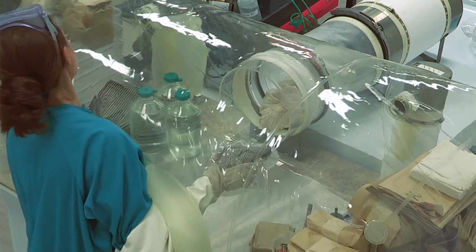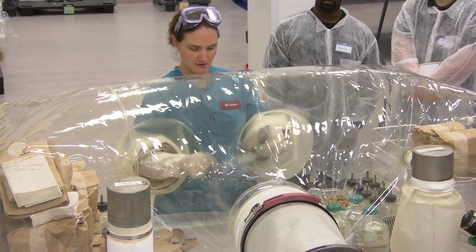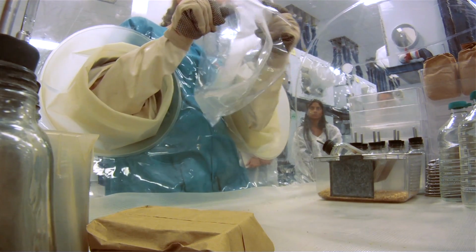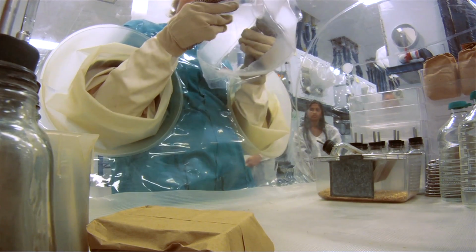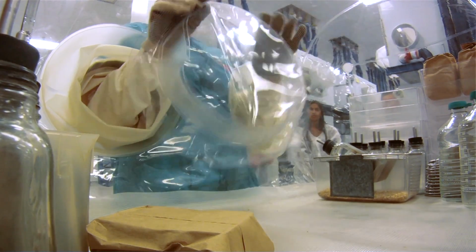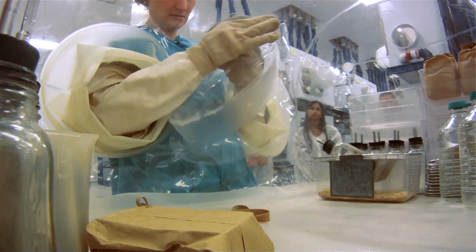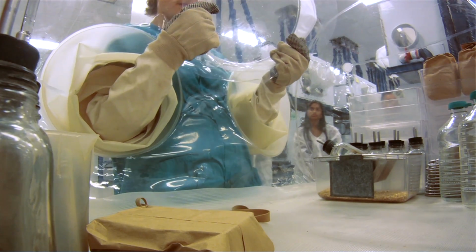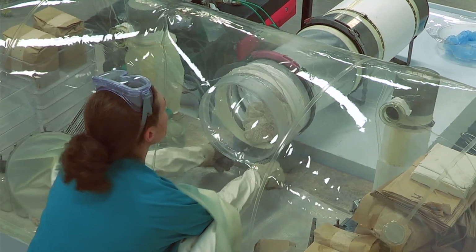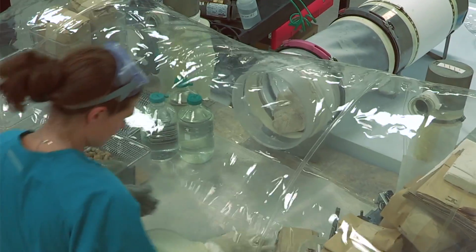So I'm just going to put my cap back on my port. And since it was off, every time the cap comes off, I always like to check it for holes just in case. Always make sure that you're looking around the seams. It's one of the most common places for a hole, where seams split. There's a pretty good chance, because we had a nice bubble, that there isn't a hole, but you never know when maybe your rubber band was covering up the hole. And then we look along the face of it and make sure we don't have any. This looks good, and place this back on. And now you can really see what the cap looks like when it's sunken in. So big difference.